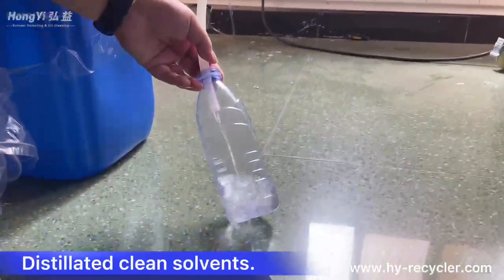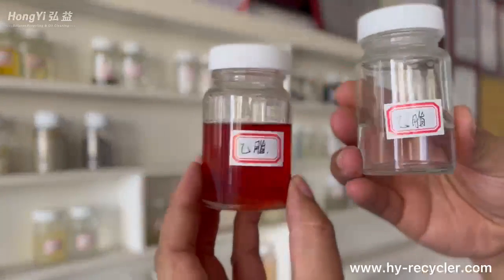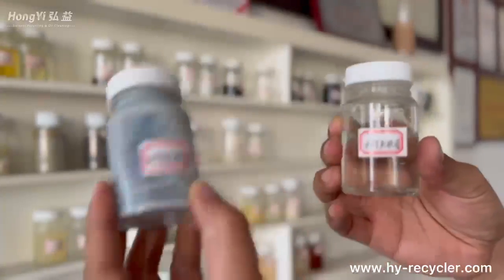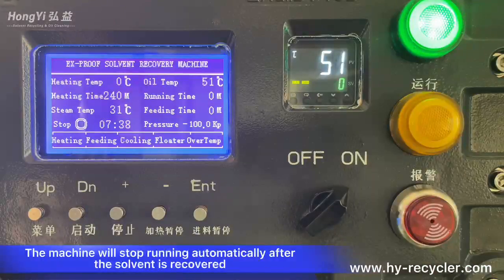Distilled clean solvents are collected. The machine will stop running automatically after the solvent is fully recovered.